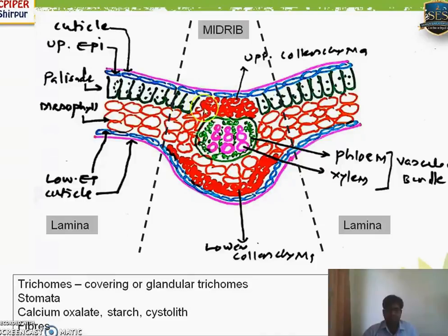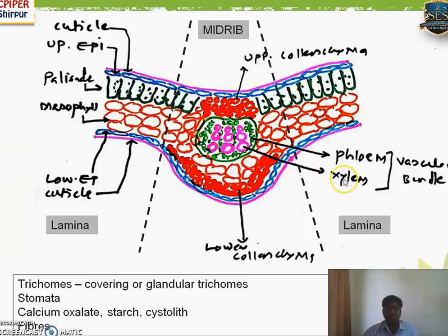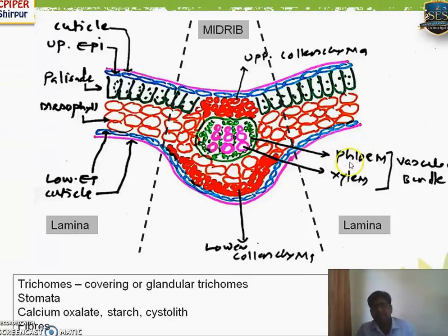Below the cuticle and epidermis in the midrib, they don't show the presence of palisade cells. Rather, they show the presence of cells with a very small lumen and thick walls without intercellular spaces — these are known as collenchyma. When present at the upper side it is known as upper collenchyma; at the lower side it is known as lower collenchyma. Being thick-walled without intercellular spaces, they are responsible for providing mechanical strength. At the center, the vascular bundle is present.